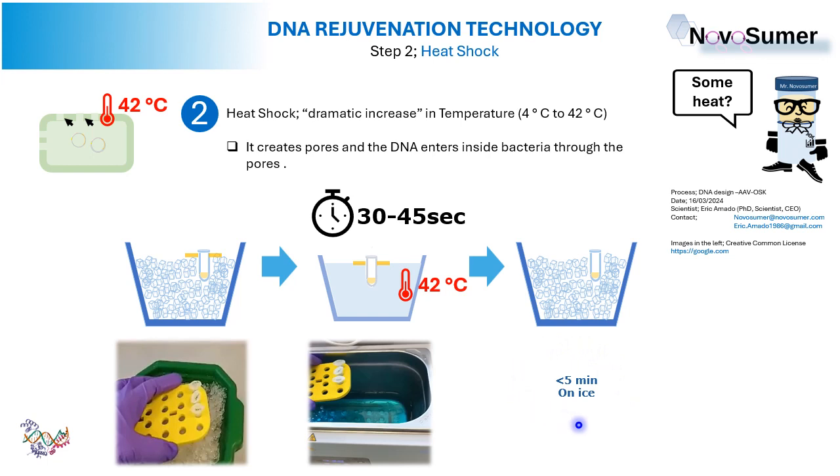Remember, less than 5 minutes. After these 5 minutes, as you can see in the next slide, we will provide a nice environment for the cells to heal, to recover. That will be the content of the next slide. Okay, easy? Let's go for the next slide.